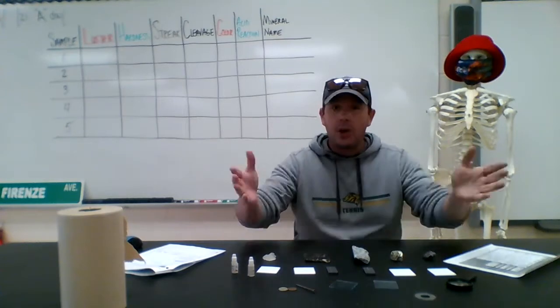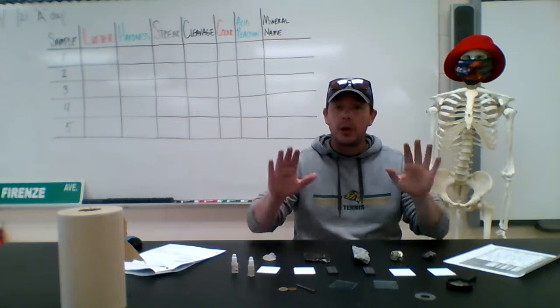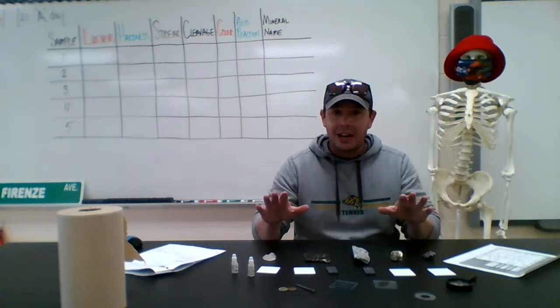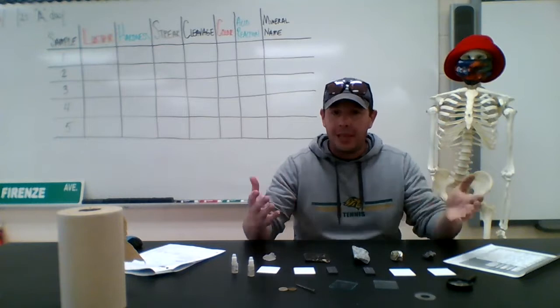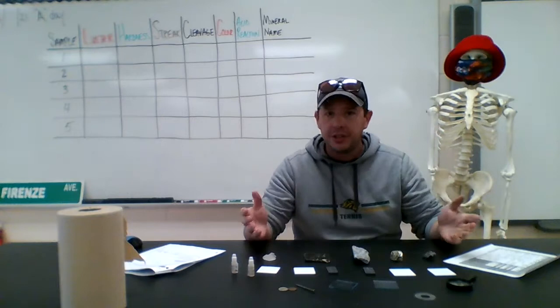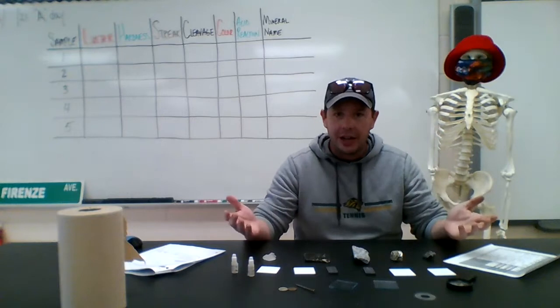So we've been talking about minerals lately, right? Remember, minerals make up rocks, and there are different ways to identify what a mineral name is. We go through a series of tests, and that's what we're going to go over today. We're going to go through the series of tests that you use in order to identify a mineral.